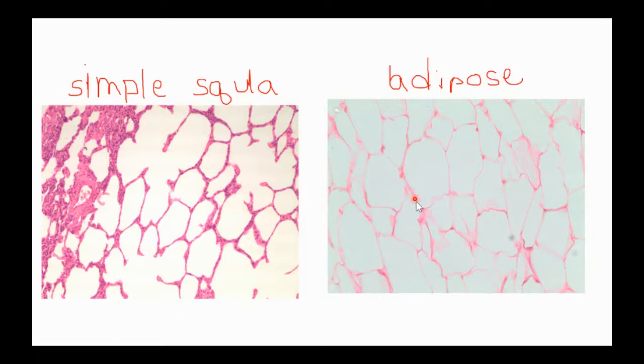So this whole space is just one cell. And for my friends who measured adipocytes, you know from the group work project, these are pretty big cells actually. Adipocytes can be pretty large. So this is one cell right here. This pink line that I'm looking at is its plasma membrane.